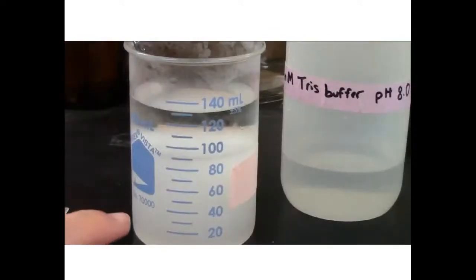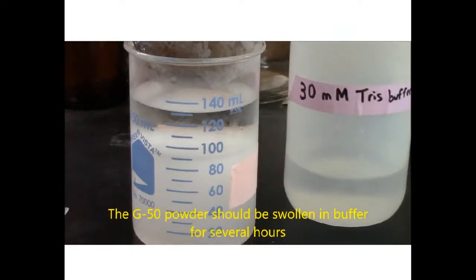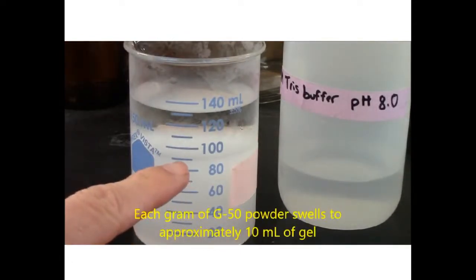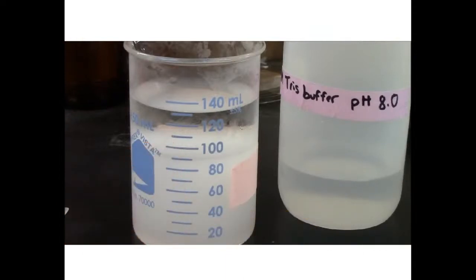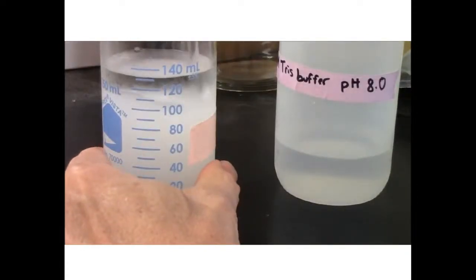In the beaker I put 9 grams of the G50 powder, and I swelled the powder overnight using this 30 millimolar Tris buffer, pH 8.0. You can see that the 9 grams has swollen up to a volume of about 90 milliliters, almost 10 milliliters per gram of solid. Now I'm going to gently stir the gel.